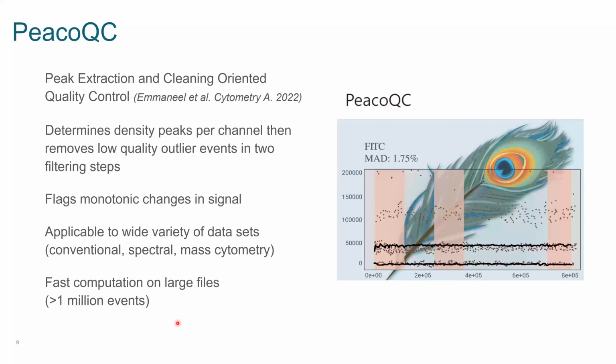Now, if you're in a position where you're going to be doing a lot of these computational tools, I'd strongly recommend investing in more RAM or a device with more RAM.